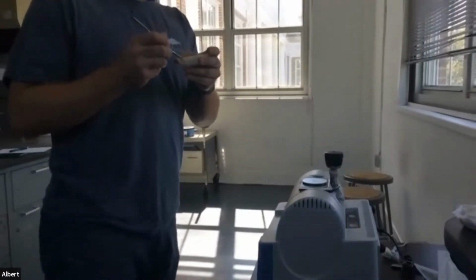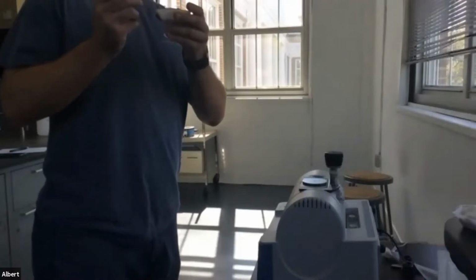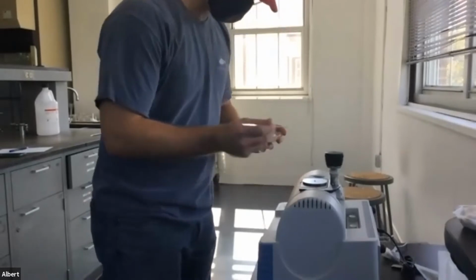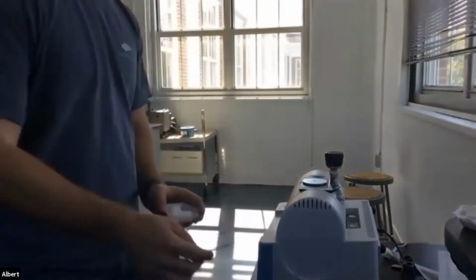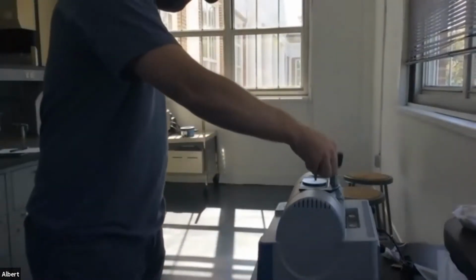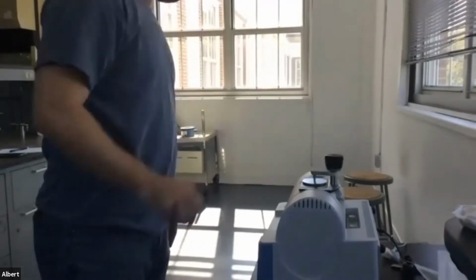A little bit more. Perfect. So put that right on that diamond. All right. You can smooth it out a little bit. Don't worry about that. It's not going to pick that up. Perfect. And then also move the arm over like that. Turn it so that it contacts the surface. You'll hear it click. Stop right there.